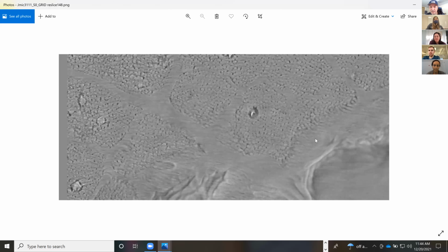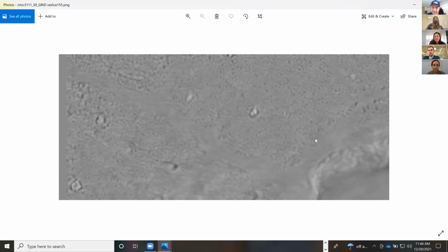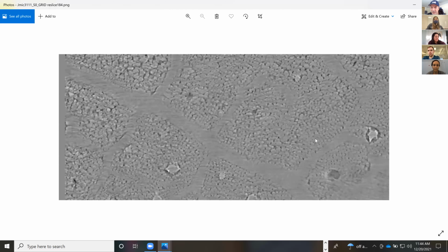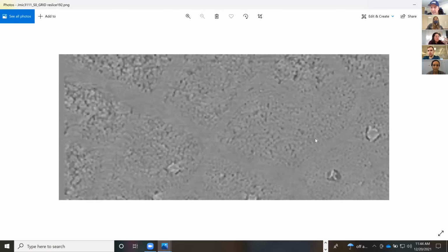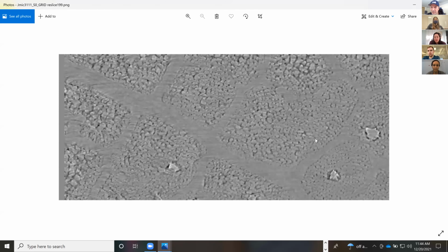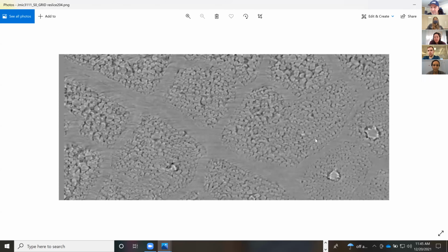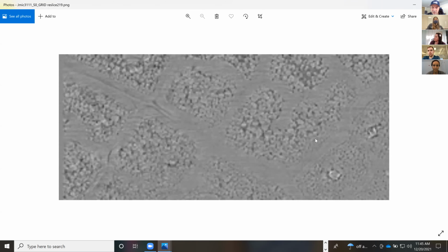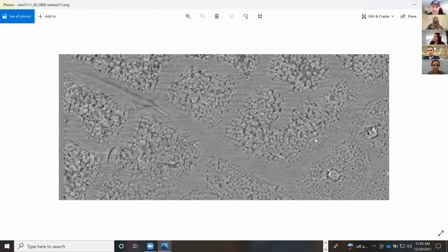But yeah, you really get a good visual of the bundle sheath extensions and veins from this perspective. And so that might tighten it up a bit. But it's just something that we haven't tried. It's certainly not an impossible feat to do. And if you wanted to try it, right here, you can actually see veins. They are right there.